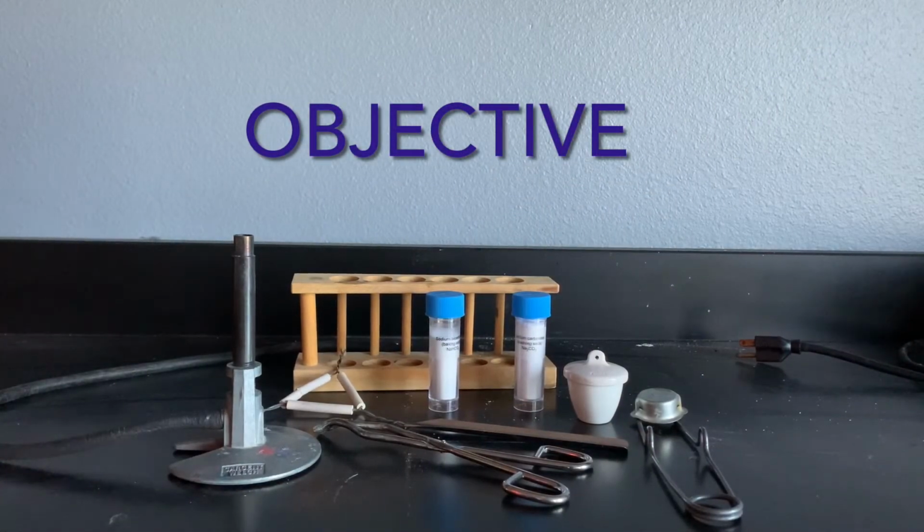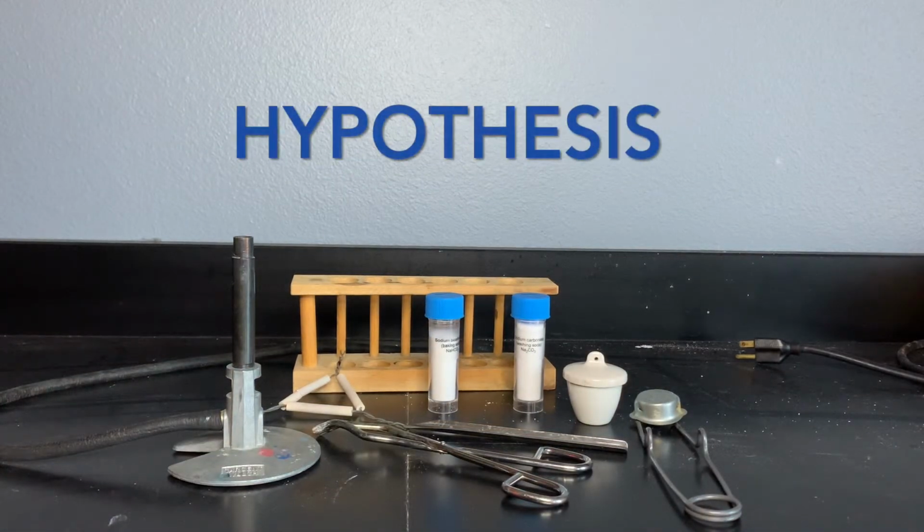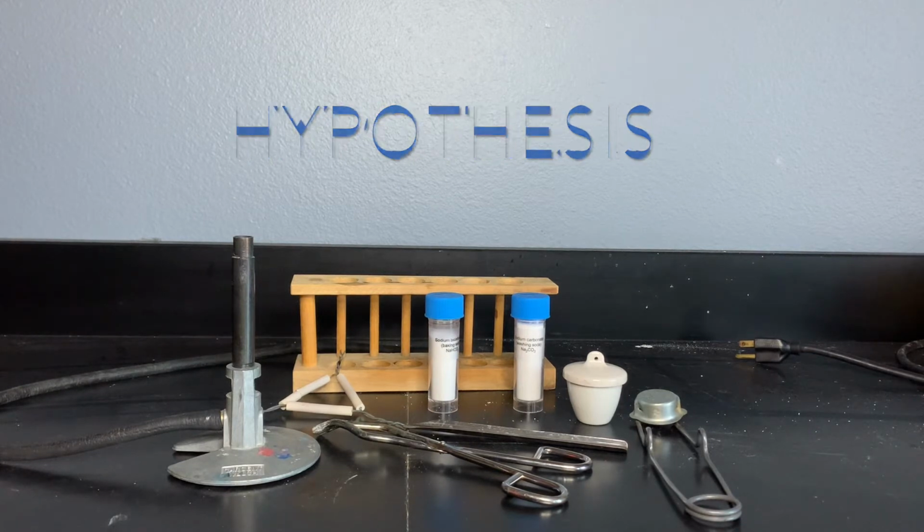Decomposition of sodium bicarbonate. Our objective is to evaluate a decomposition reaction and determine the stoichiometric relationship. So again, we're practicing our skills from class. Hypothesis. Take time to think about the process or the reaction for the decomposition of sodium bicarbonate. What do you expect to see?